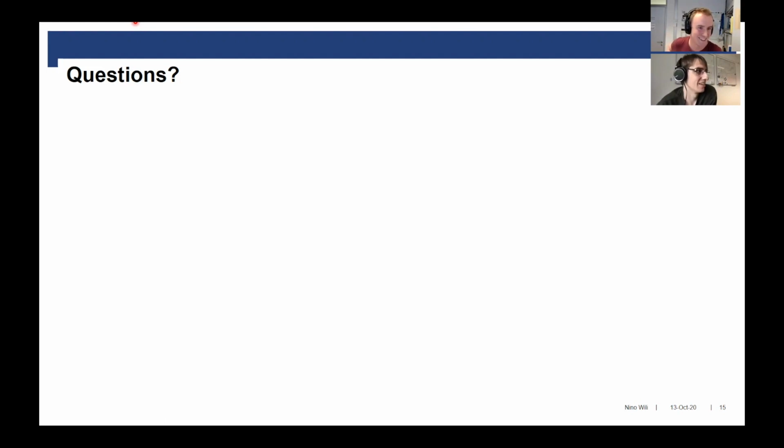Okay, a question from James Ives. Is there future scope for moving away from CW EPR with engineering improvements that would allow for broader pulses? So I'm using broadband pulses, so I guess yes. But I'm not sure if we will abandon CW totally, because you have seen how broad the spectra are.